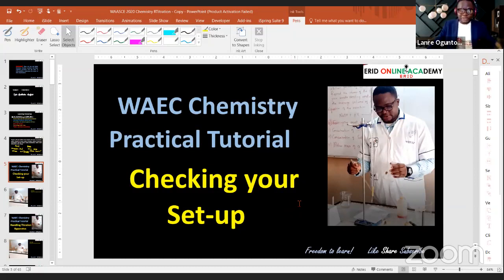And not to make mistakes, you must ensure that your setup, every material that you need for your work, is on your table. That is what we mean by setup. Make sure that all the materials that you need for your experiment are on your table. Okay, good. So let's see how we can do our checkup for setup.